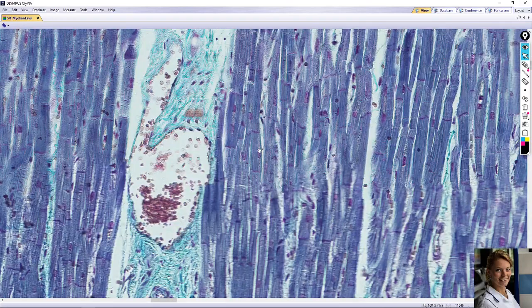Maybe here it's a purple nucleus and small dots around the nucleus, in the pole of the nucleus.